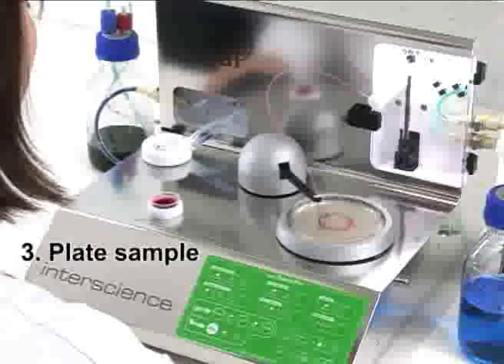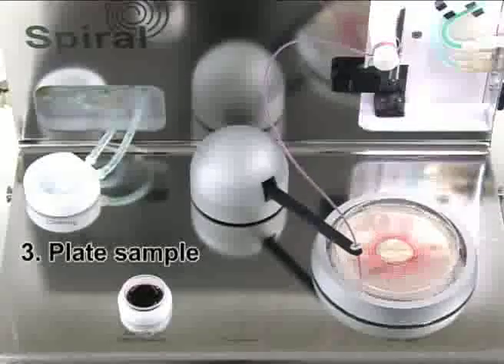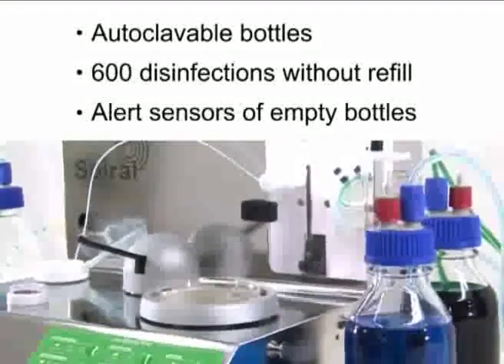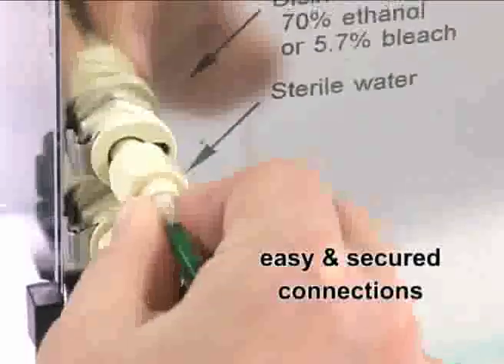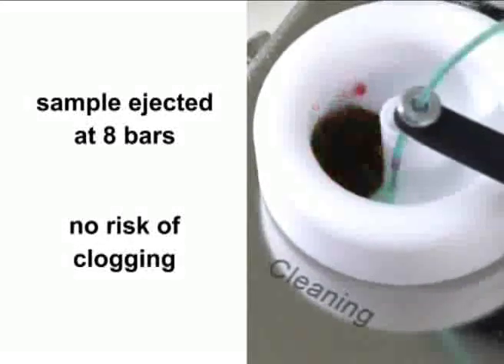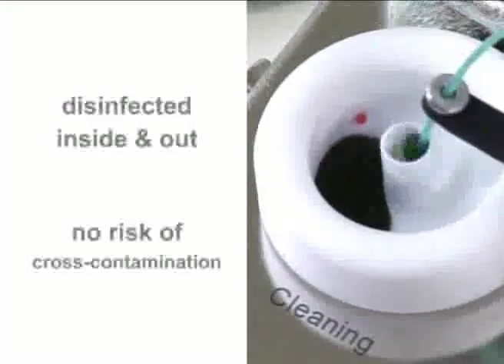You have a petri dish ready for incubation in only 25 seconds. The EZ Spiral offers the most advanced technology on the market. No need for constant refills and maintenance — simply plug the bottle connectors to the machine. This new patented disinfection system is user friendly and guarantees a contamination-free plating.